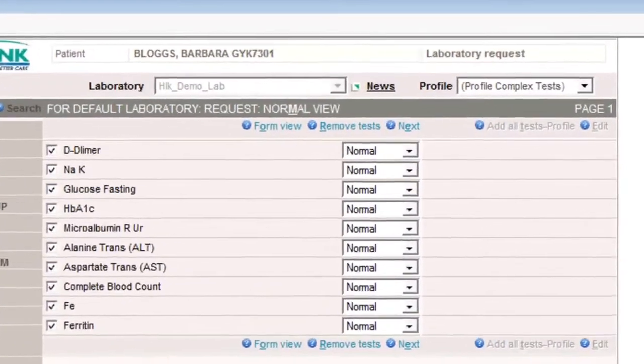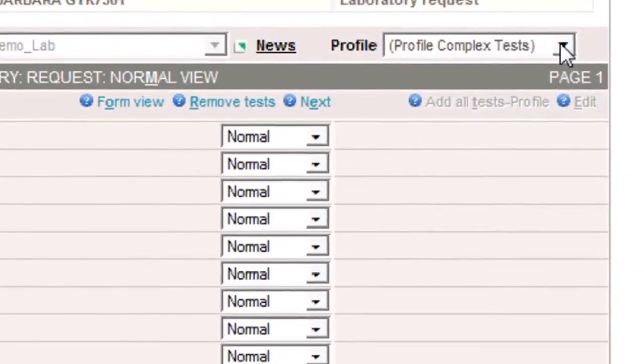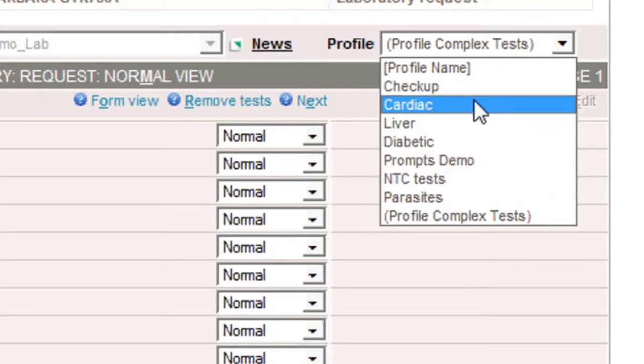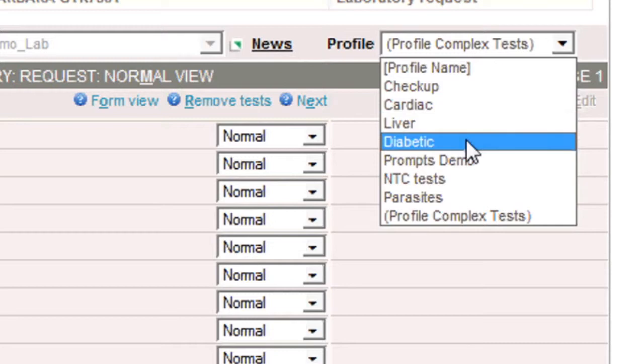With the form view, it's the tick boxes, and with the more tests view, I can then have some protocols that are set up, and so there are protocols for diabetes, for drug monitoring, and in fact I can create some of my own. So if you have a standard set of protocols that you'd like for blood tests for people on particular drugs, or doing regular tests for something, then you can set those up and it will just come up as a regular pattern.